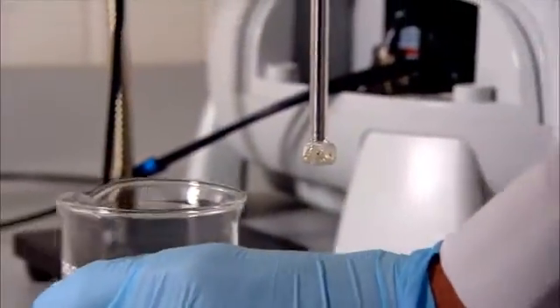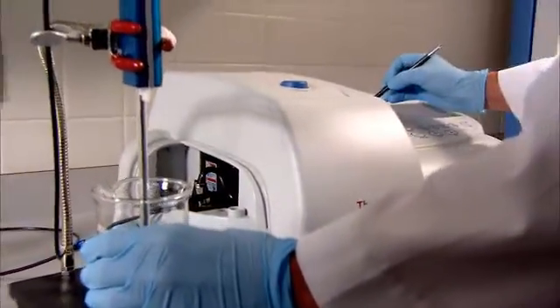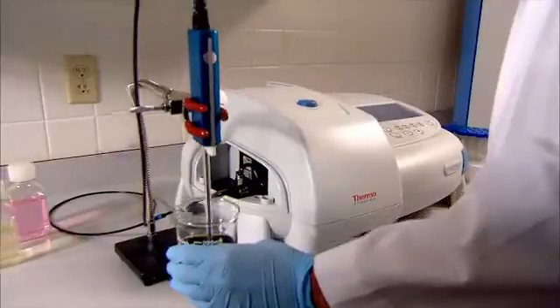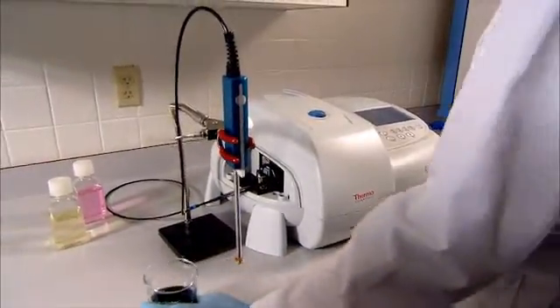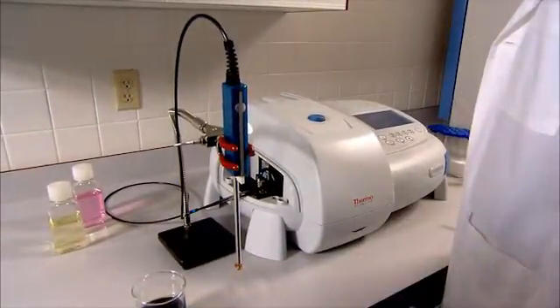Proprietary application-focused beam geometry technology that optimizes the optical configuration of the instrument to your applications and maximizes performance from microcells, solid samples, or fiber-optic probes.